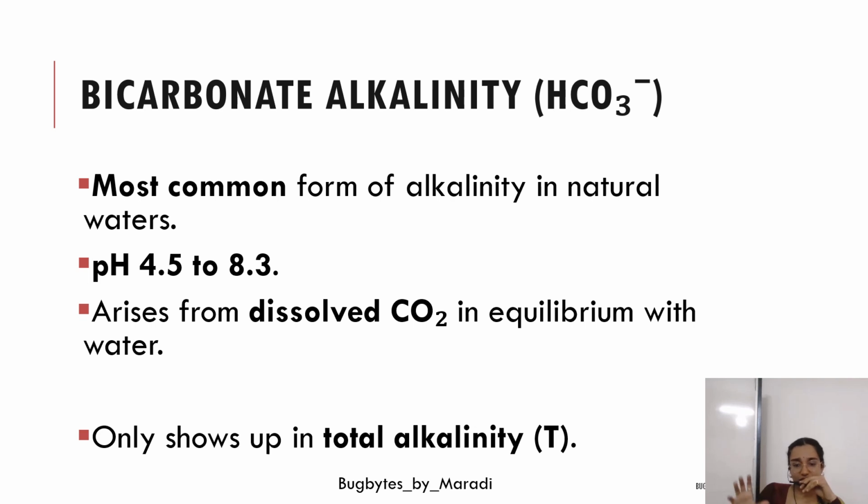The pH range is somewhat like 4.5 to 8.3. If the pH range is like that, you will be having the bicarbonate alkalinity. This is mainly again due to dissolved carbon dioxide, and because of that, we'll be having the bicarbonate alkalinity.